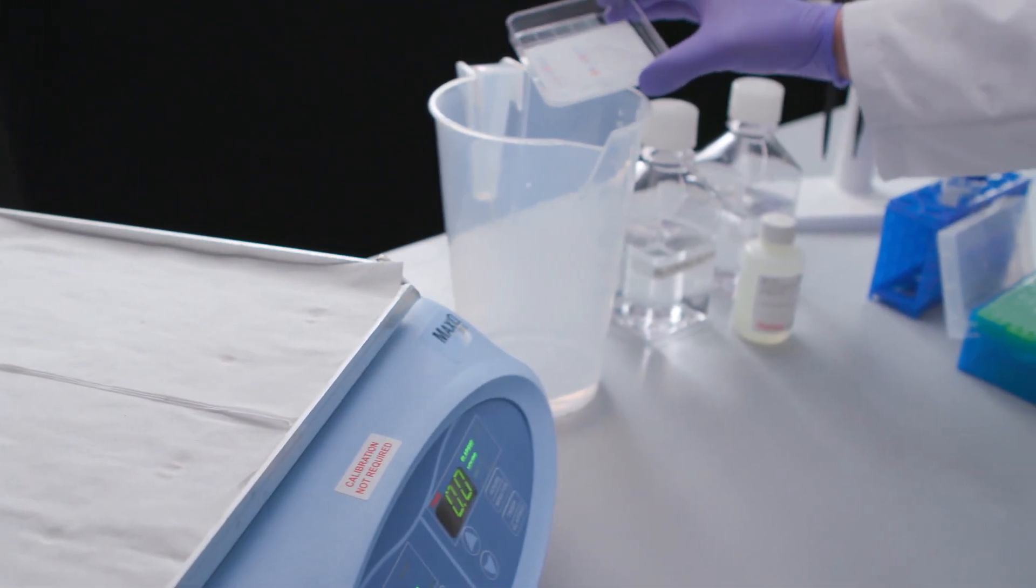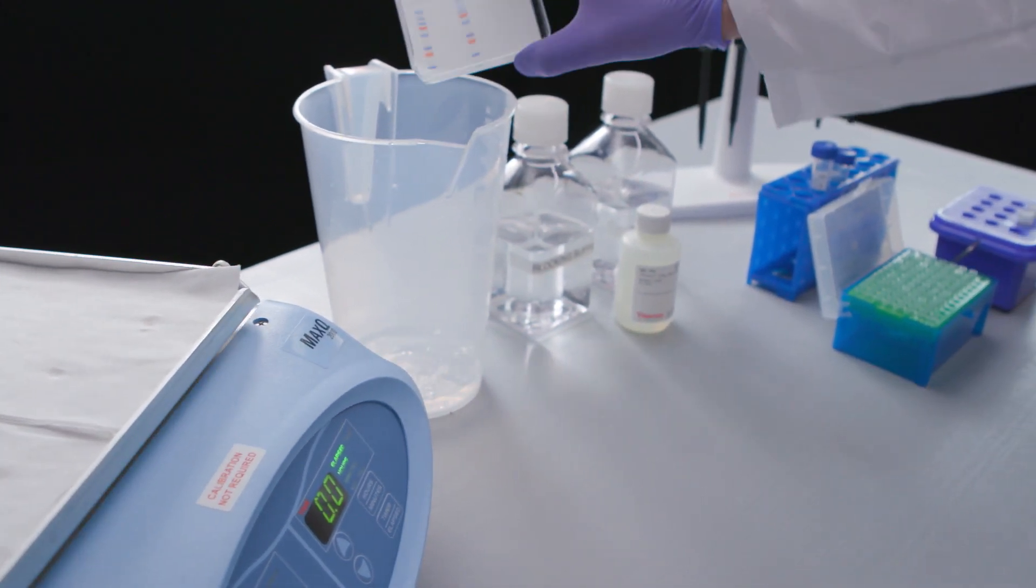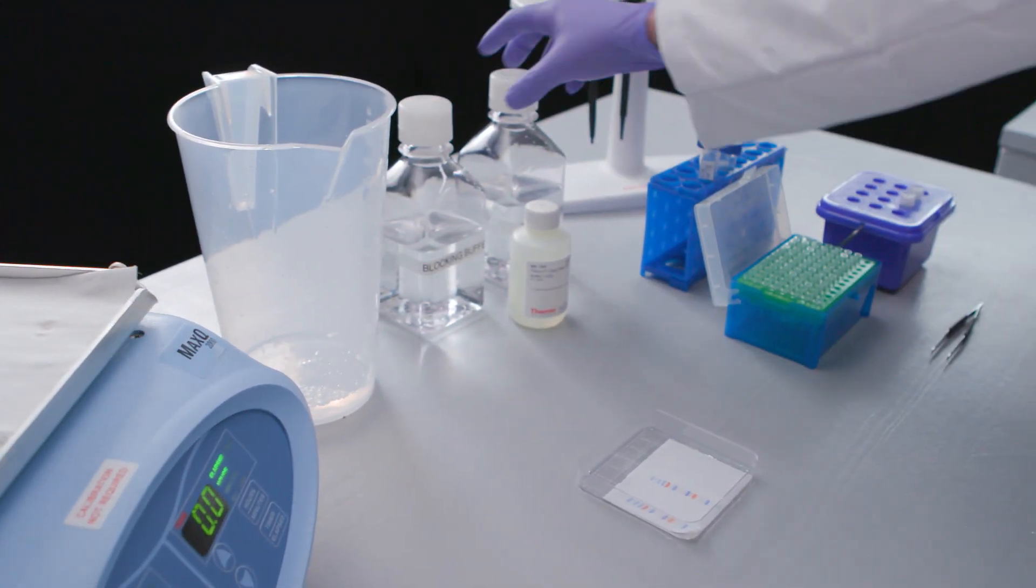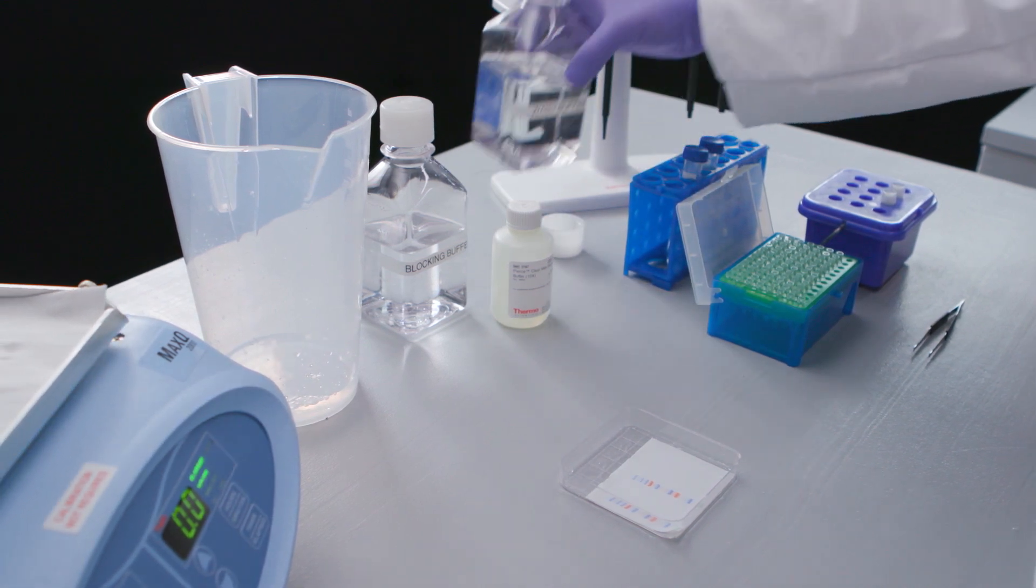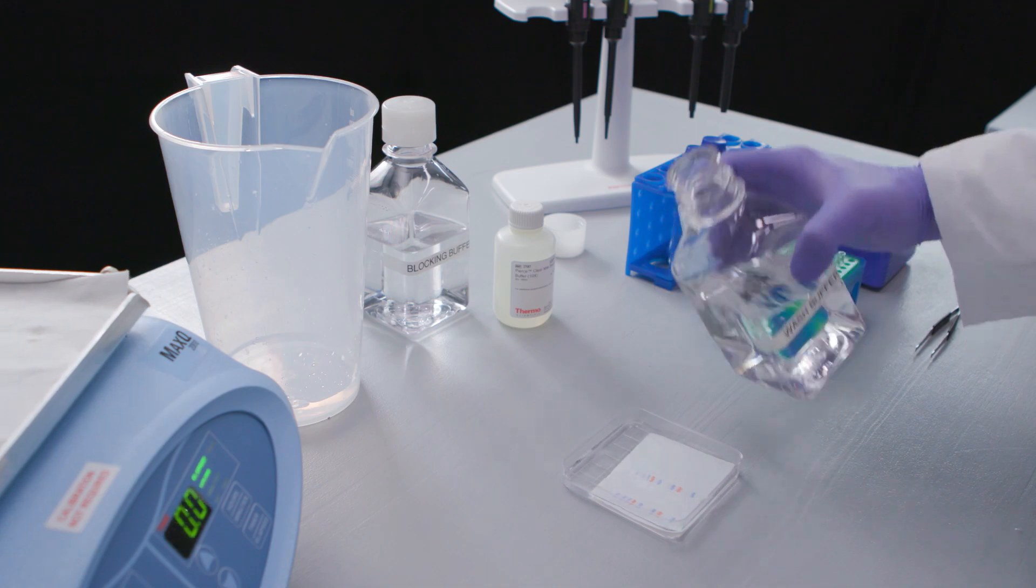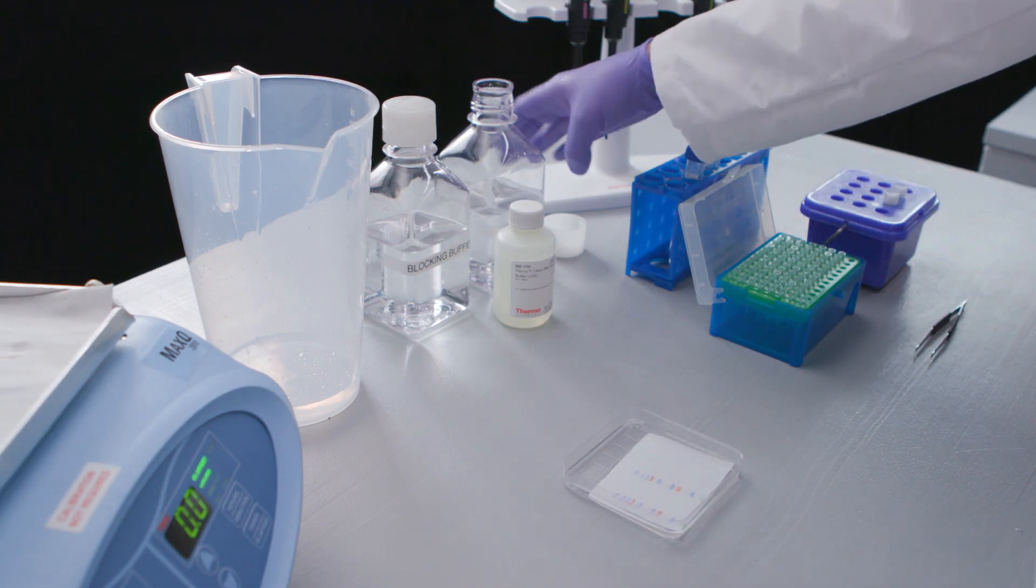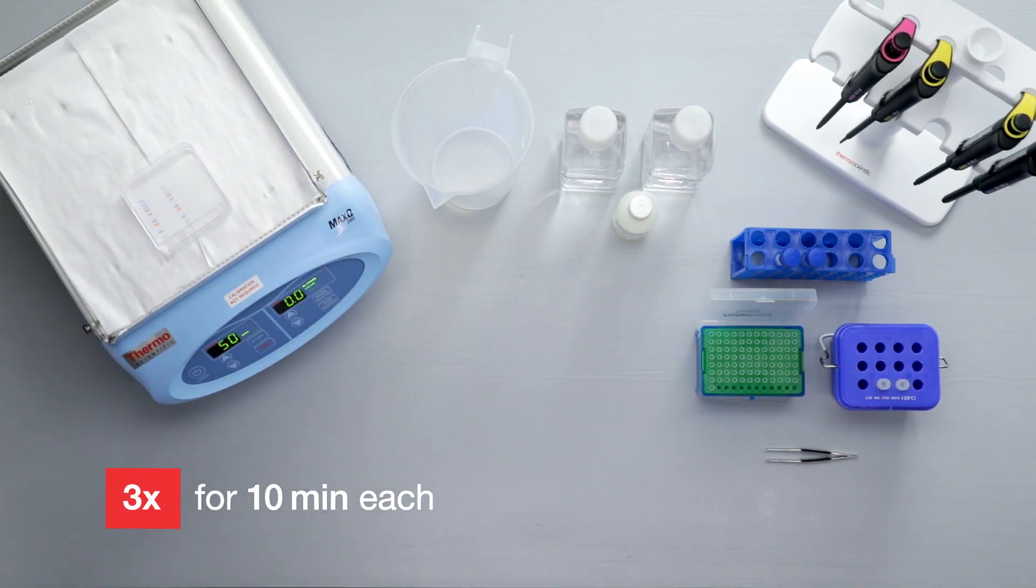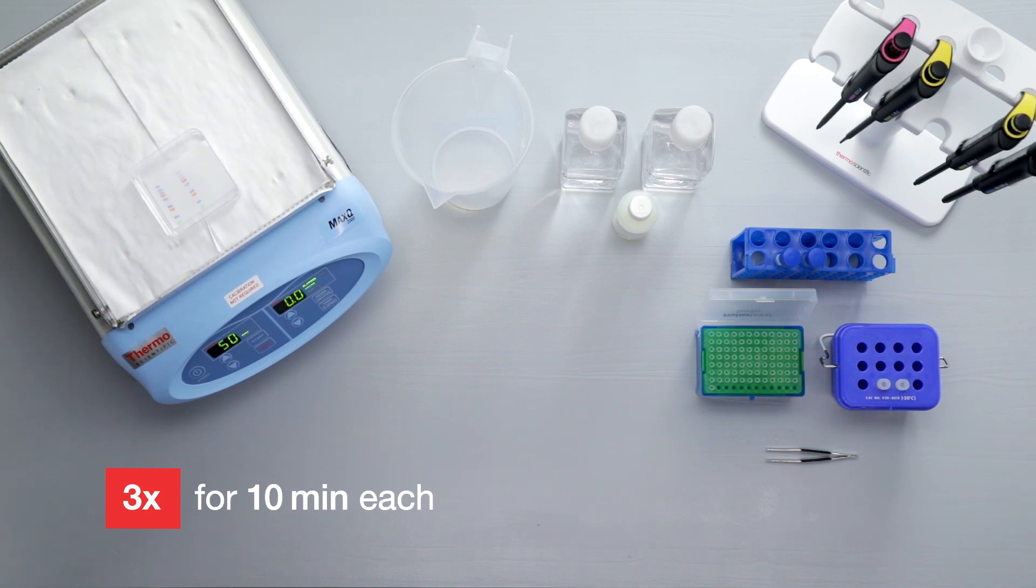Remove any unbound primary antibody by performing a series of washes. The typical wash buffer is TBS or PBS based, with 0.05 to 0.1 percent detergent. Wash the membrane 3 times for 10 minutes each in wash buffer with gentle agitation.